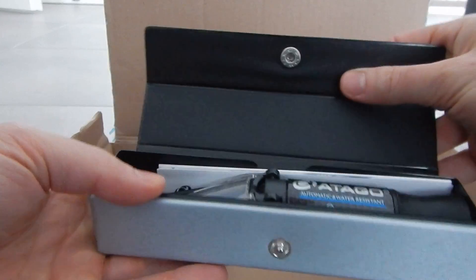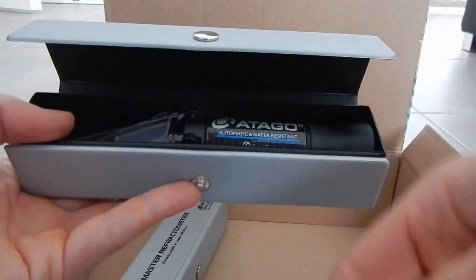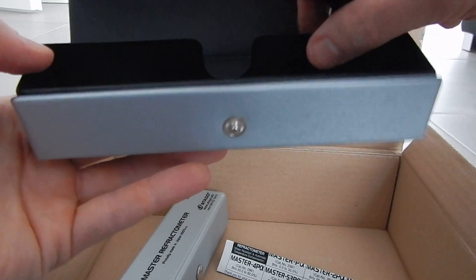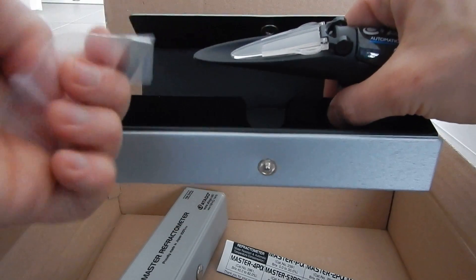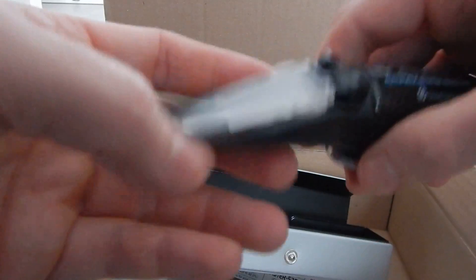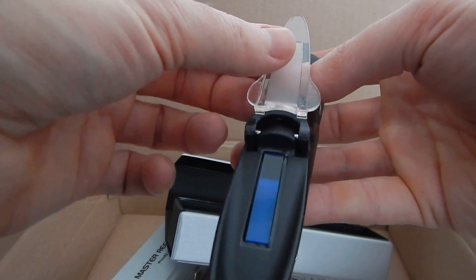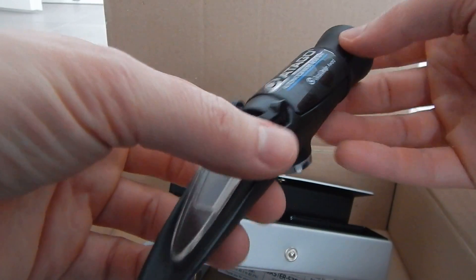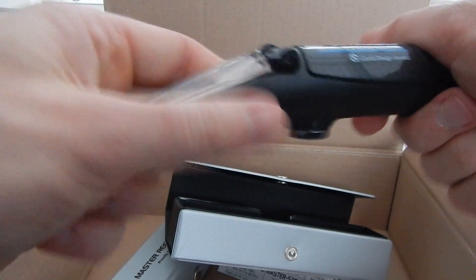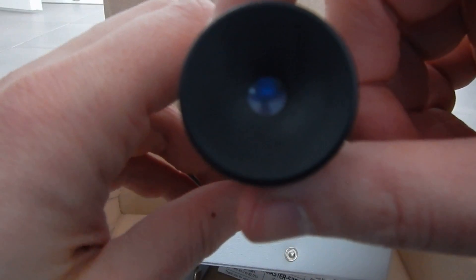Wow, what a nice little box. So what do we have here? A little instruction manual, and the device. And what we have here — a little bit of something else. The device looks very cool, it's quite robust. You should be able to look inside here and see the measurement.